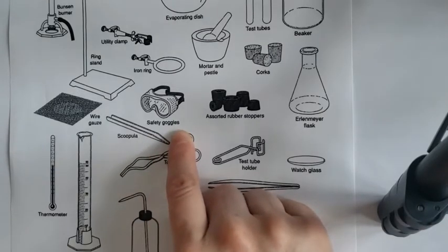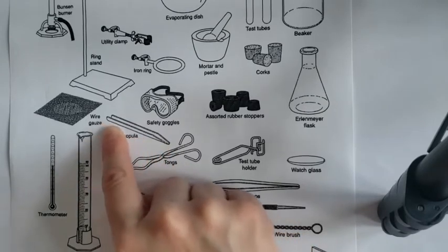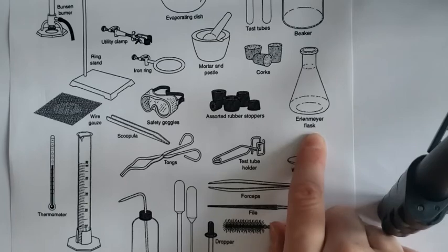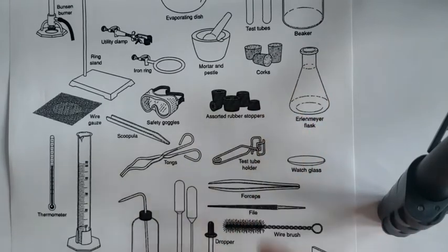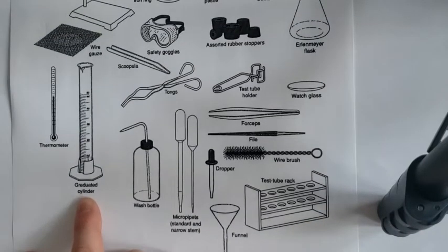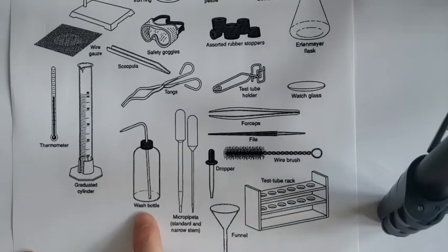So we have safety goggles. Scoopula is basically like a spoon. You're going to use this in your very first lab. Erlenmeyer flask is if you want a little bit less splashing. It narrows at the top versus a beaker. Let's keep going. Graduated cylinder to measure liquids. Thermometer, you know what that does. Just a wash bottle or water bottle.